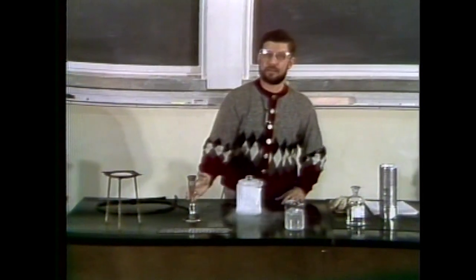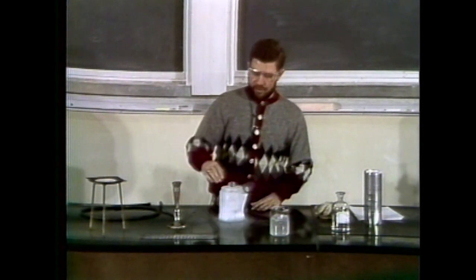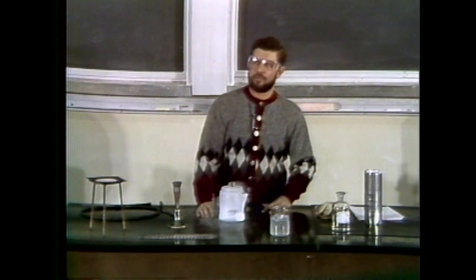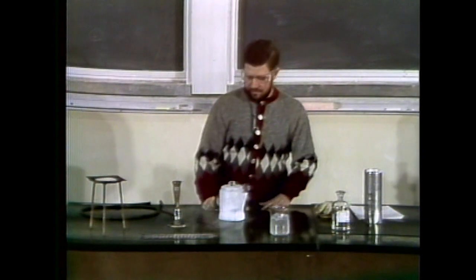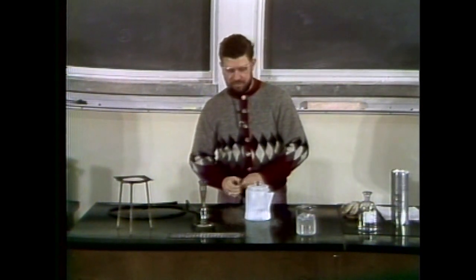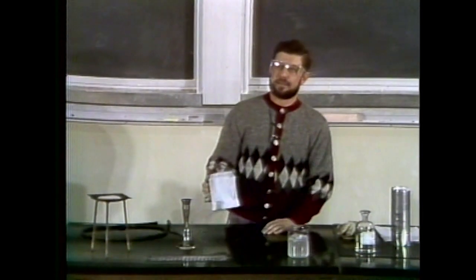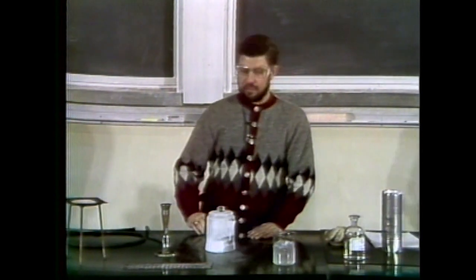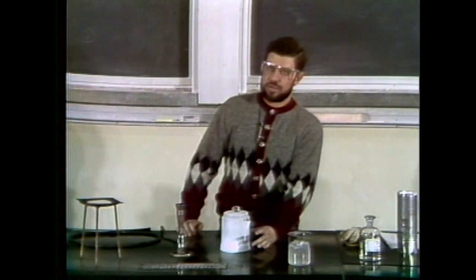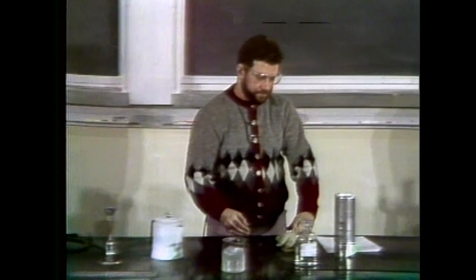Well, that's very good. The combustion of methane yields carbon dioxide and water, and because the liquid nitrogen is at such a low temperature, the nitrogen is in the liquid form, then the material that condensed at the bottom is solid carbon dioxide and of course, frozen water, which is ice. And you see, this is a way of making solid carbon dioxide. Actually, it's not a very good way of making solid CO2 because the liquid nitrogen that you have to use is much more expensive than the CO2 that you end up producing.